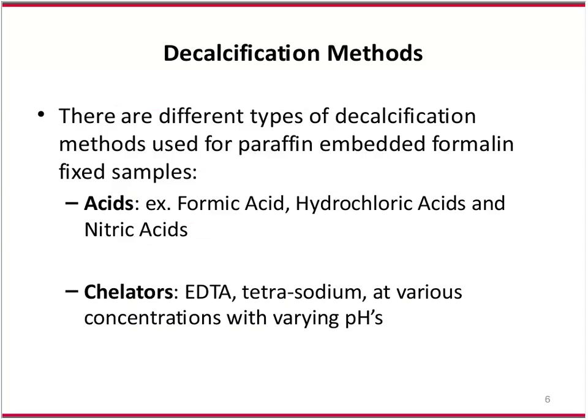There are different kinds of decalcification methods used in paraffin-embedded formalin-fixed samples. You can decalcify with acids such as formic acid, hydrochloric acid, and nitric acid. Or there are chelators, which are EDTA, tetrasodium, at various concentrations with varying pHs.